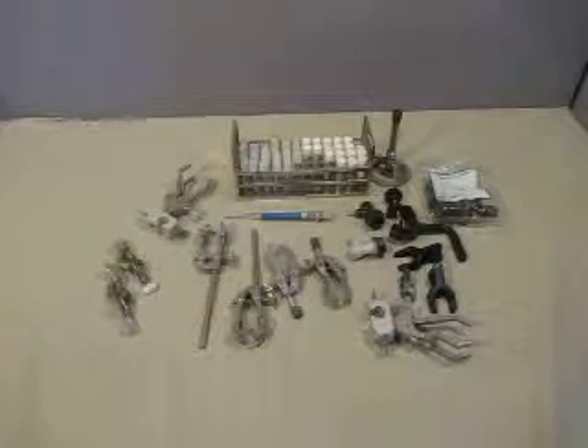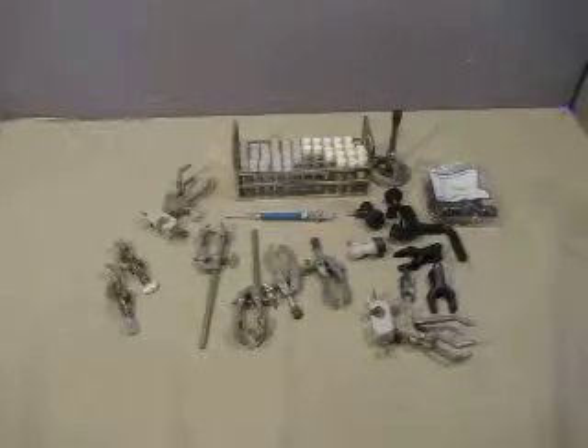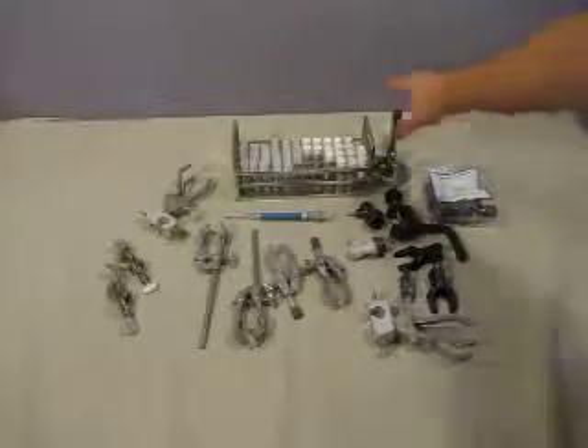Up for auction we have a lot of laboratory accessories or equipment. We've got a couple things here — a vial tray which is about 10 inches, a small Bunsen burner, and a few other items we'll cover off here.